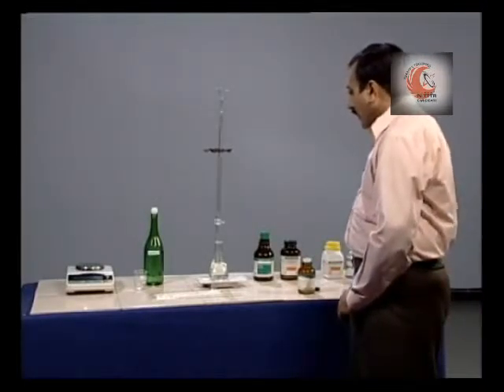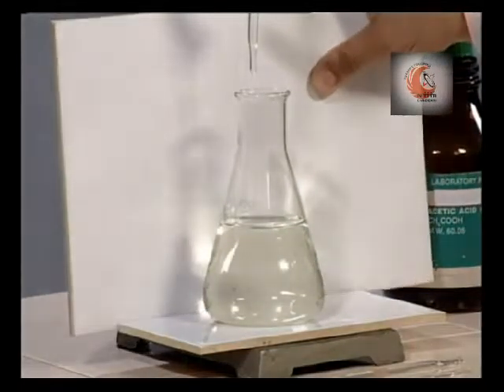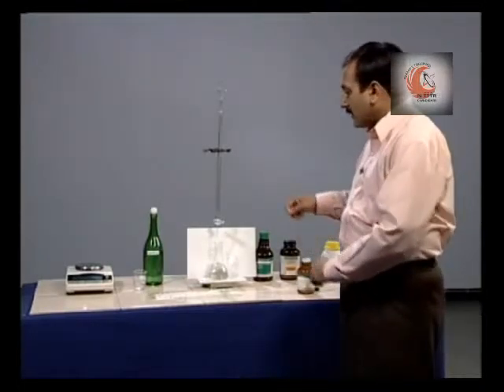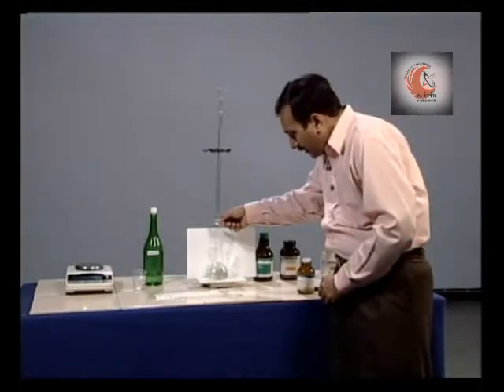The color should always be viewed against a white background. Now, titrate the sample till the yellow color disappears.